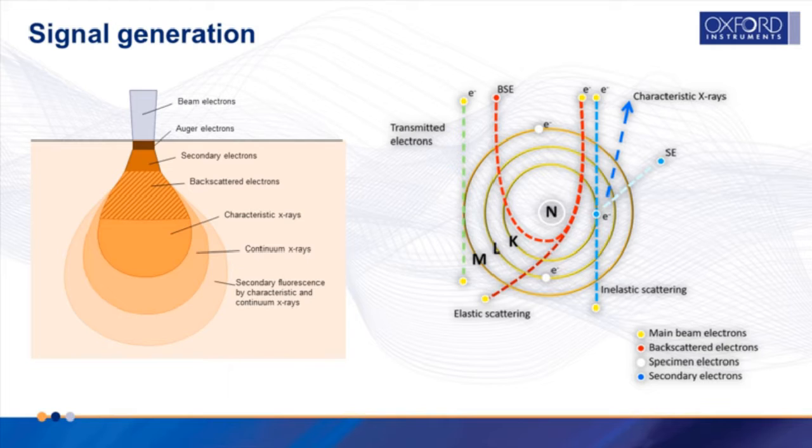In a TEM, the normal bright field image is produced as a result of electrons being transmitted, as shown in green in the diagram on the right, or scattered by elastic and inelastic scattering events, which creates contrast. More electrons are scattered by heavy elements compared to light, which is why in a TEM you need a density difference between your samples and the surrounding substrate, something that has been traditionally increased using heavy metal stains. Scattering is also important for SEM and produces a range of signals including secondary electrons, backscattered electrons and characteristic X-rays.